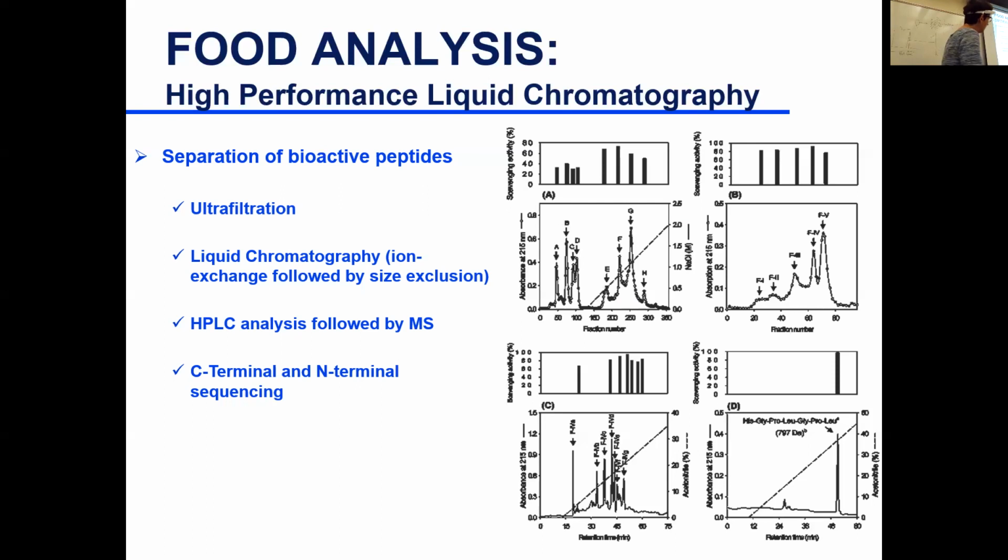So you have multiple separations that you can do. For example, peptides might have the same charge but different size, or the same size but different charge. And then you might have multiple peptides that have the same charge and the same size, but they vary in their amino acids, so they will react differently with the reverse phase chromatography. So multiple dimension HPLC is common for separation of compounds that have similar structural characteristics, in order to get a very pure compound to identify.